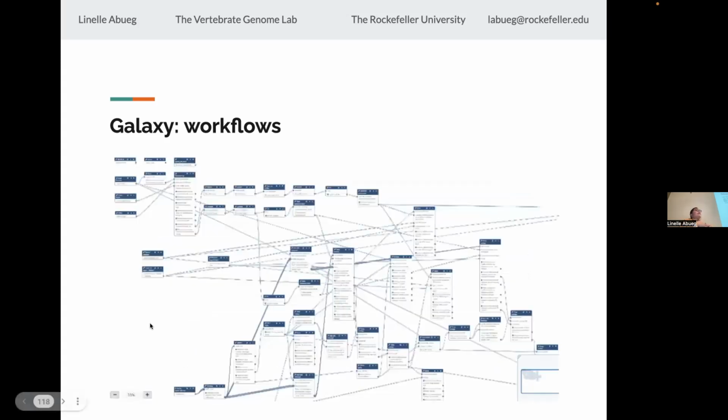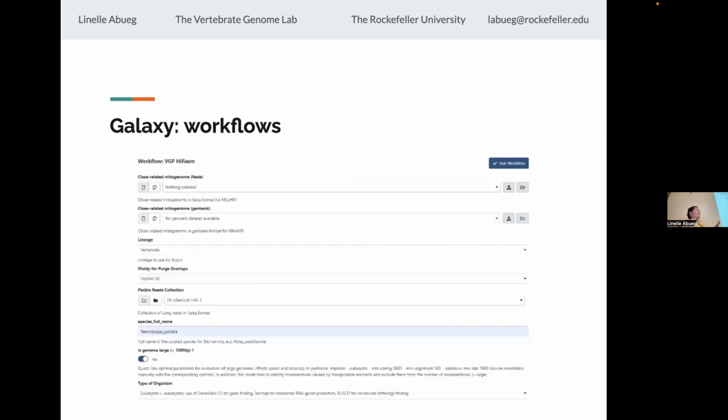Because in the practicals, we'll be doing this step by step. We will not be running a workflow, we'll be running it step by step together so we can all get a better grasp on why each step of the genome assembly workflow is in there. It's not a lot of manual work, but you will rename stuff manually, and so that's why I'm plugging this.